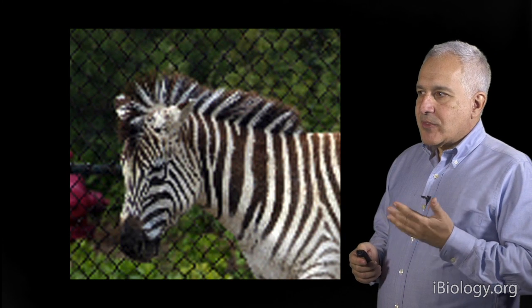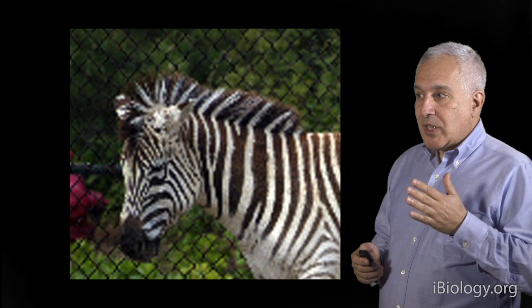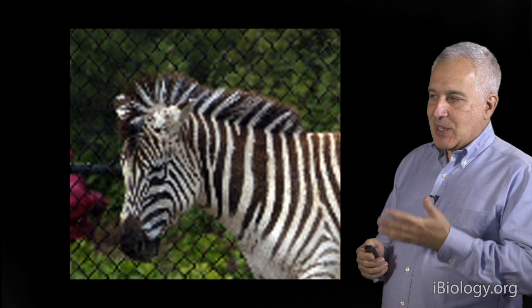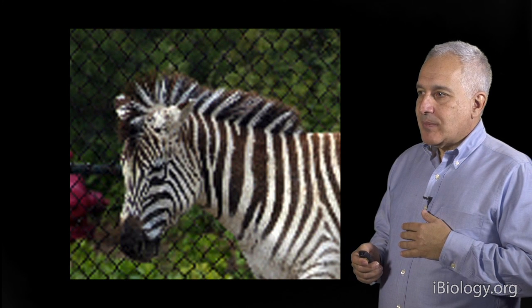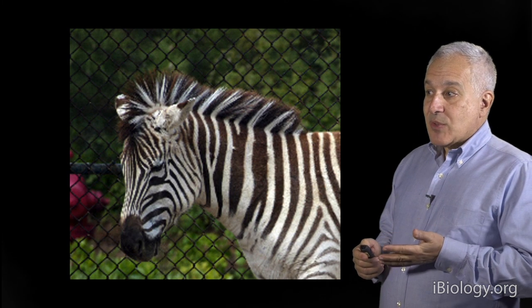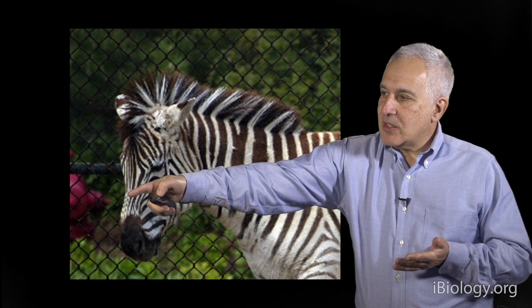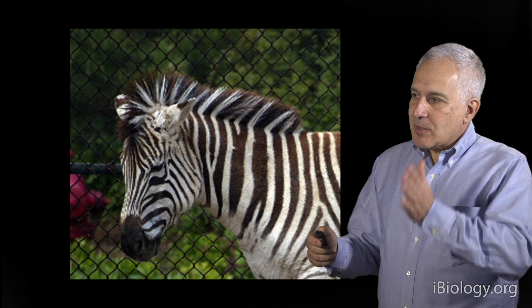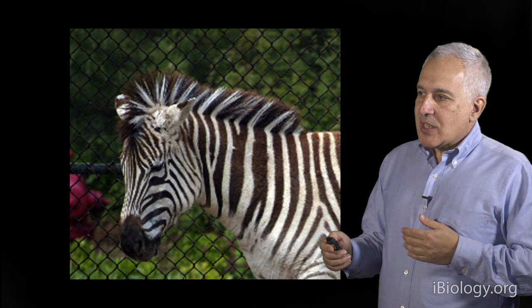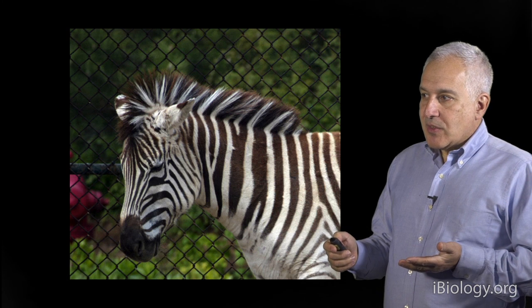Well, let's resolve this image by using even better paper or a better camera with higher, not better lens, just a better resolution, more megapixels, let's say if it's a CCD or a solid state camera. And you see that those stripes have also disappeared now. So now, do we have the real zebra yet? Well, it's hard to know. You may notice on the other side of the nose, there are still some diagonal lines that seem not symmetric with the other side. Well, let's image at even higher resolution, and you see those have gone away. So this looks like a pretty good image of a zebra.